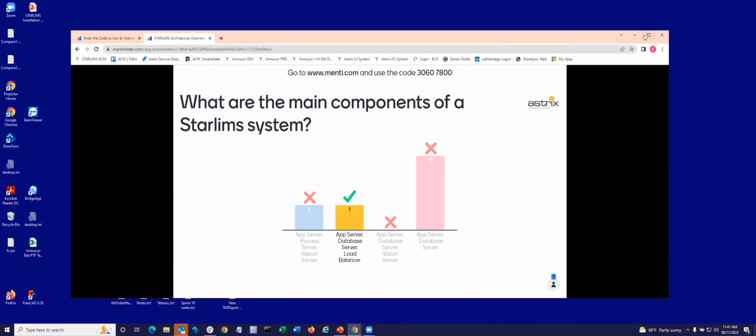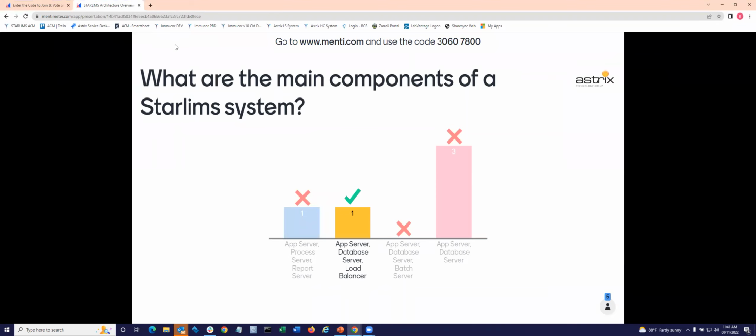I'm not sure why it's not forwarding on here. Okay, here we go.